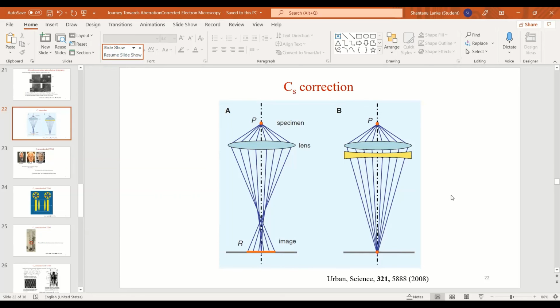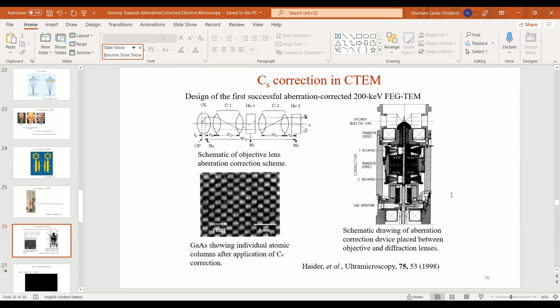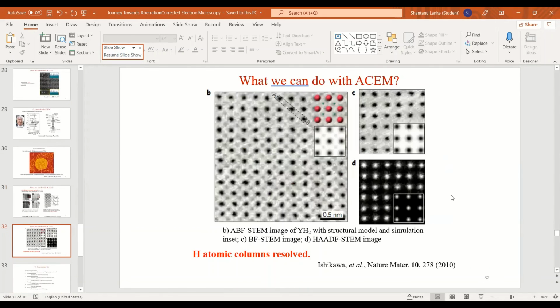And you have some aberrations called parasitic aberrations, which are very difficult to control. Ideally you should have no temperature gradient between the column and the room, no flowing winds, no electromagnetic fields, and you should not speak. In principle, if the resolution or the information limit of your instrument is say 0.8 angstroms, then the external or parasitic aberrations should be less than 3 times, that is, less than 0.3 angstroms. If you have more aberrations in the environment, then there is no use of correcting for the aberrations and you just lose atomic resolution anyway. So you're just going to waste the money.